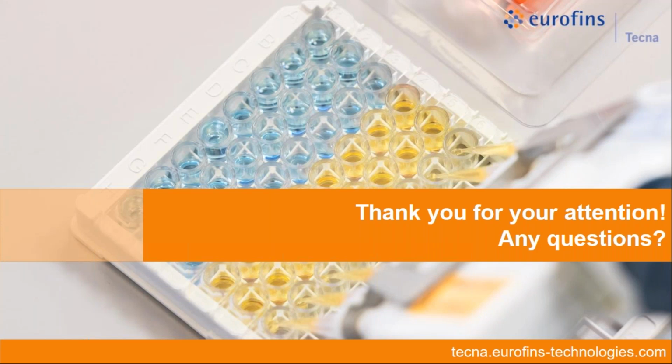Nevertheless, we know that automatic washing is possible. Think, Evelina, that most of our ELISA test kits have been validated for being run by an automatic analyzer, so since the pipetting, including the washing and the reading. We haven't applied this very assay on a robot yet, but I do believe that with proper washing settings, it could eventually also be washed by an automatic washer. Yes, of course. Thanks for the clarification of both aspects.